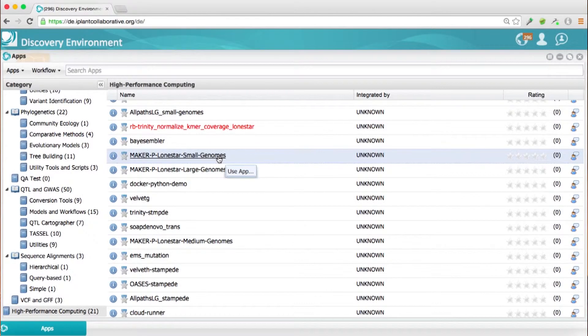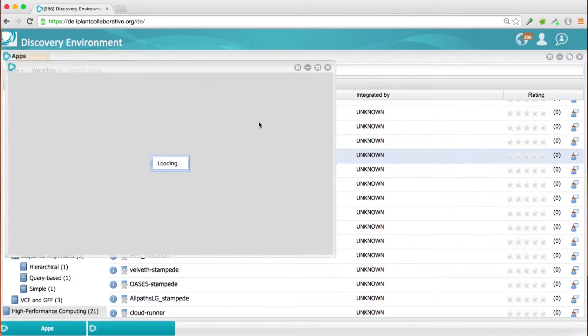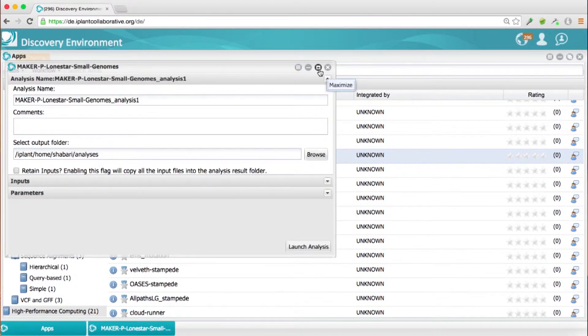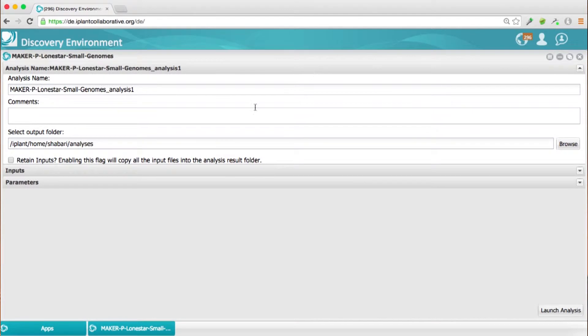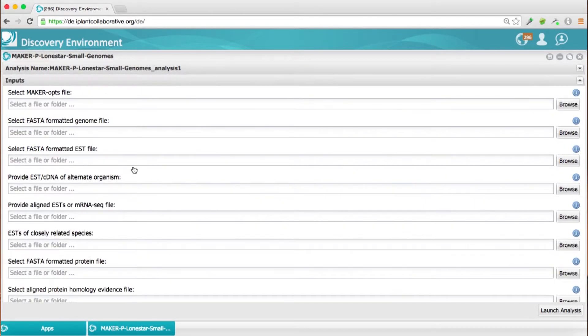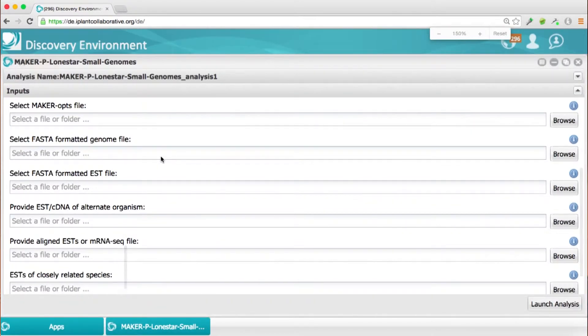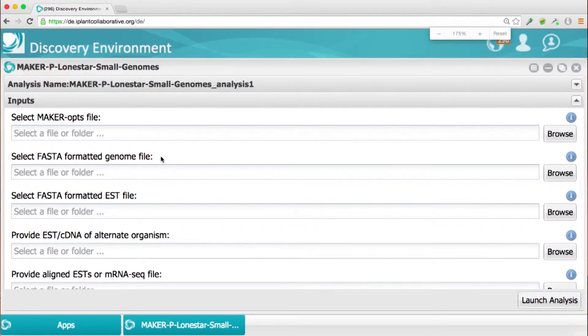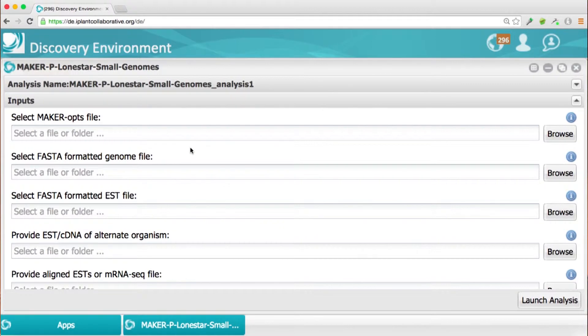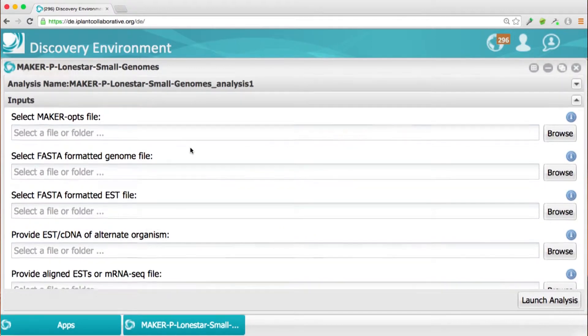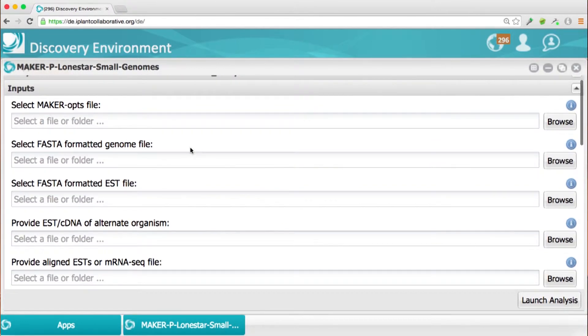So this is actually going to quickly go through the input options. So these are the input files. So those of you have run MAKER know that MAKER takes FASTA files for the genome and the different EST files, the protein files, and so on. So this is where you would choose to enter them.